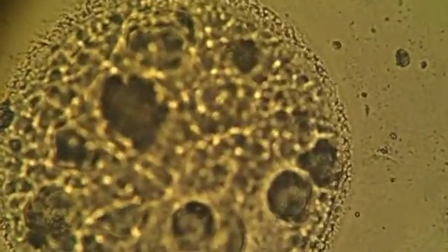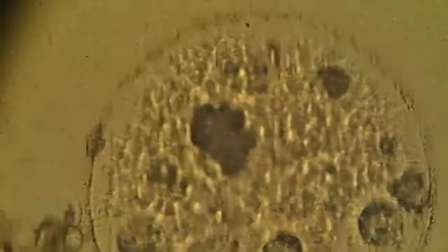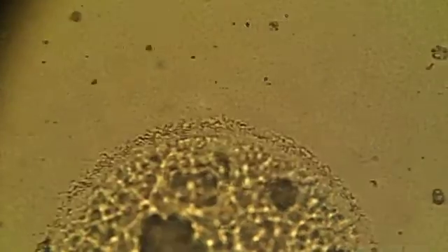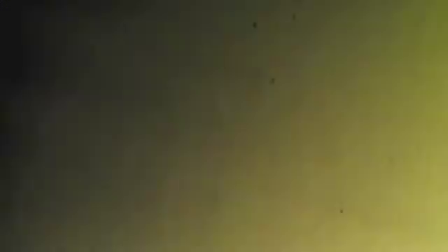You can see it's Ichthyophthirius — so they contain cilia all over the body. And you can see that around the edges it looks like they're radiating something — these are actually the cilia. So this is white spot disease, otherwise known as Ichthyophthirius multifiliis.